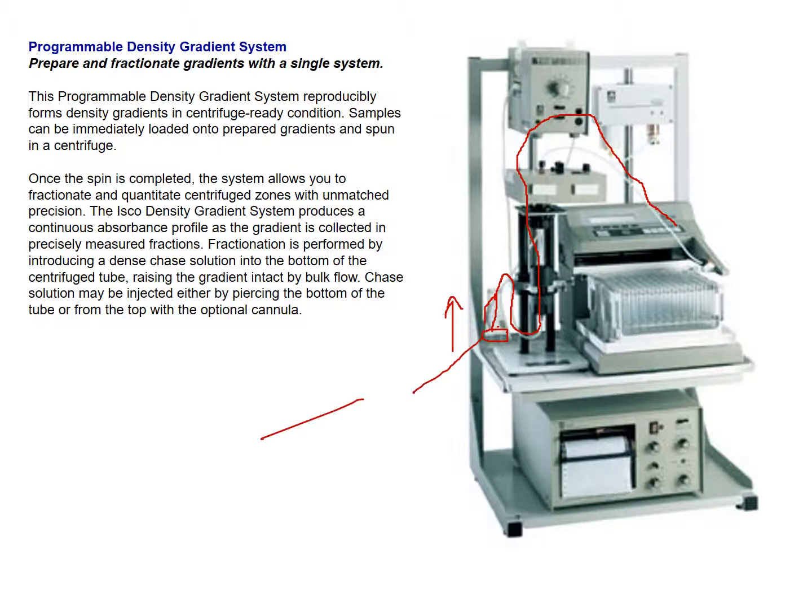So sample up through the tube, and each one of these is a test tube, and that's the fraction. So when we talked about fractions, that's a fraction collector.